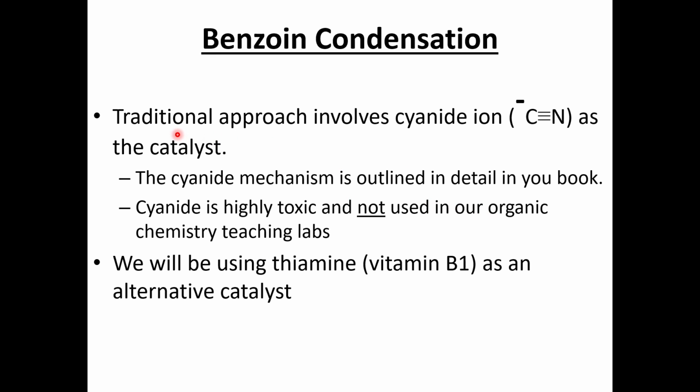This synthesis normally uses the cyanide ion, which is this one over here, as a catalyst for this reaction. But the big issue with this ion is that it is a very strong poison for our blood, so it can cause death to living things, and so we are going to try to avoid this reagent in this lab.